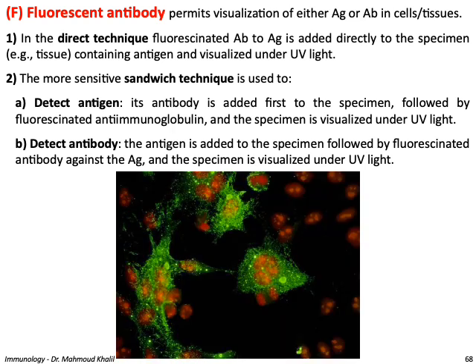So you can see here how they can use different fluorescent antibodies with different excitation to see different colors. You can see that in this example, these cells have been labeled fluorescently. The green is for some of the proteins in the cytoplasm, and the orange is for some of the proteins in the nucleus. So you can use multiple different fluorescinated antibodies to detect different proteins.